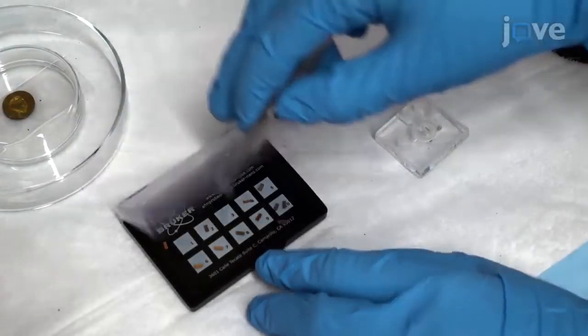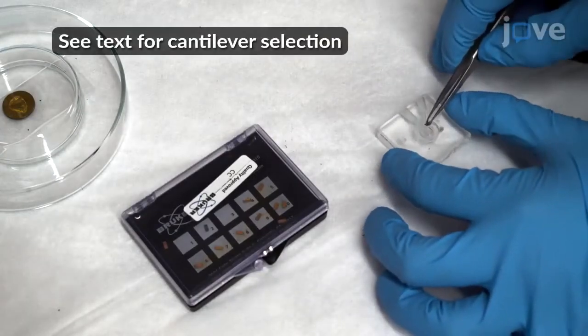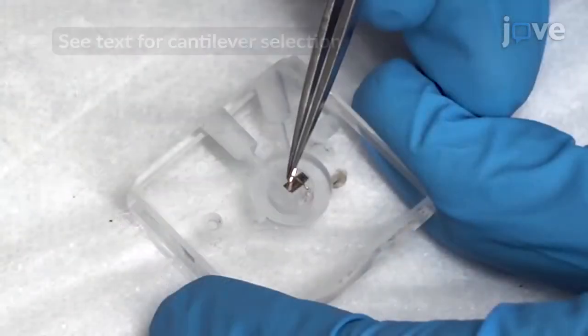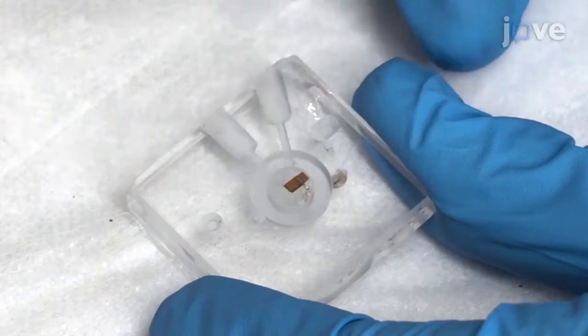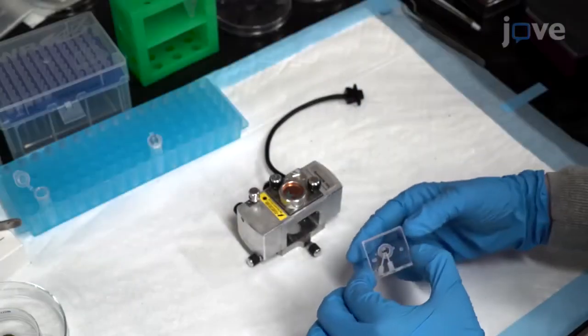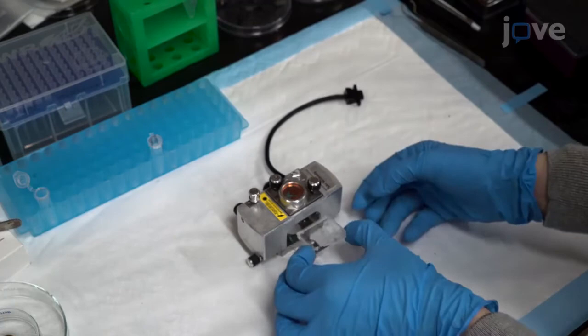First, carefully pick up the cantilever by the end and place it in the probe holding cell. Ensure that the cantilever is firmly seated. Then place the holding cell in the AFM head.